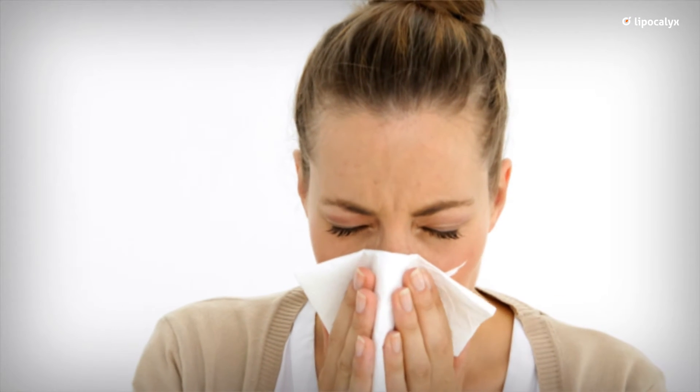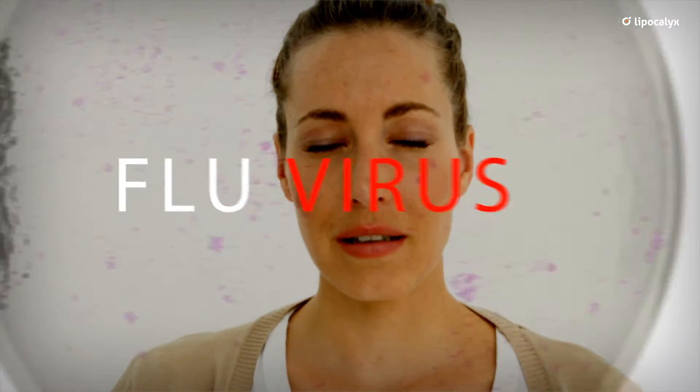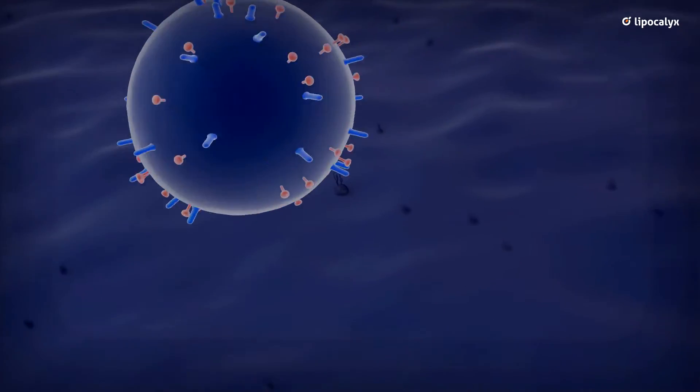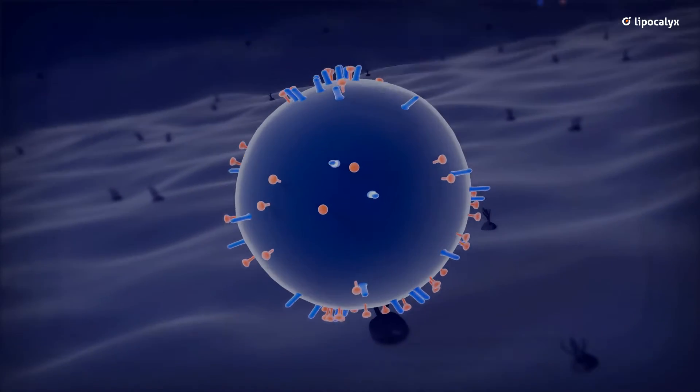What starts with a sneeze is one of the most efficient ways to transfer DNA. The influenza virus is traveling down the airways, penetrating the mucus, and then facing its ultimate barrier.